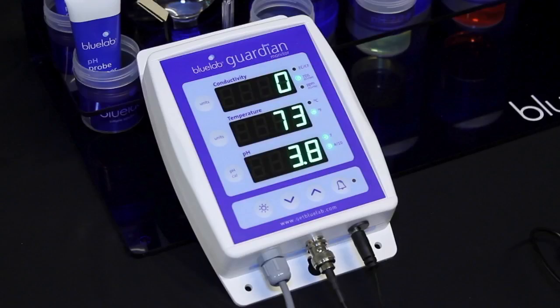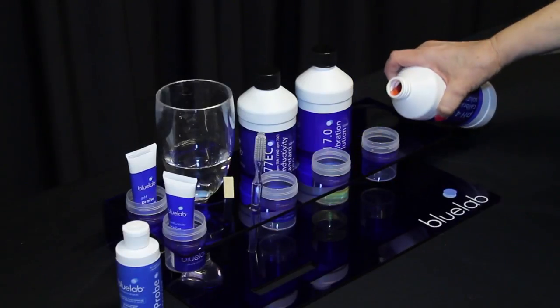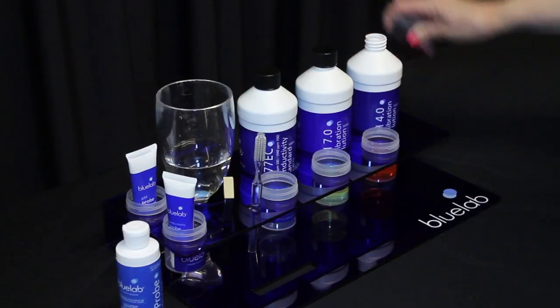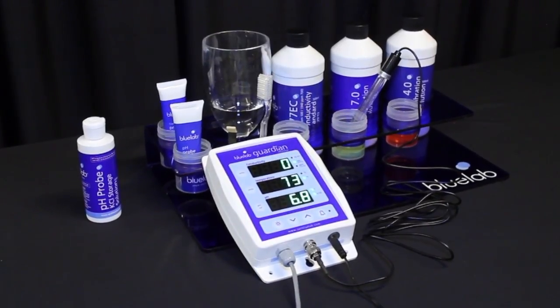You'll know it's time to calibrate the pH probe when the two green pH LEDs are flashing. Calibrate your pH probe to two points for accuracy. Use freshly poured pH 7.0 and pH 4.0 calibration solutions. Ensure the Guardian is on.